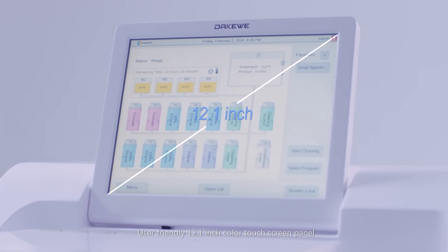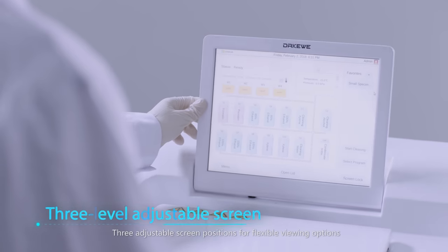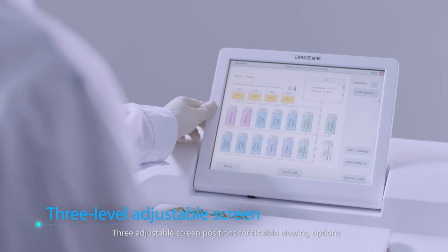User-friendly 12.1-inch colored touchscreen panel with three adjustable screen positions for flexible viewing options.